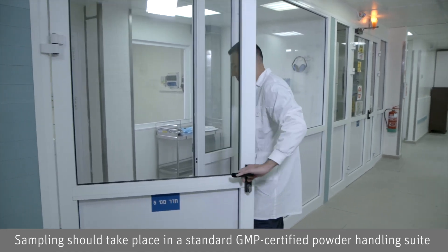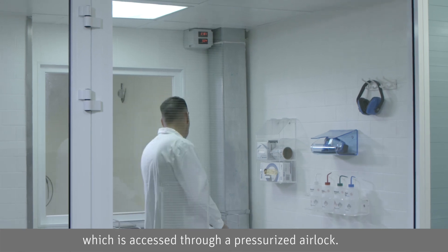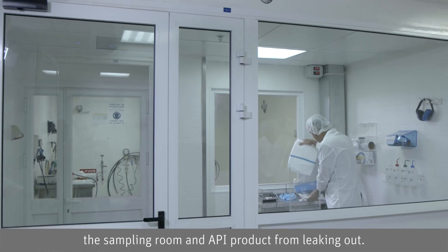Sampling should take place in a standard GMP certified powder handling suite, which is accessed through a pressurized airlock. The airlock serves as a barrier to keep contaminants from entering the sampling room and API product from leaking out.